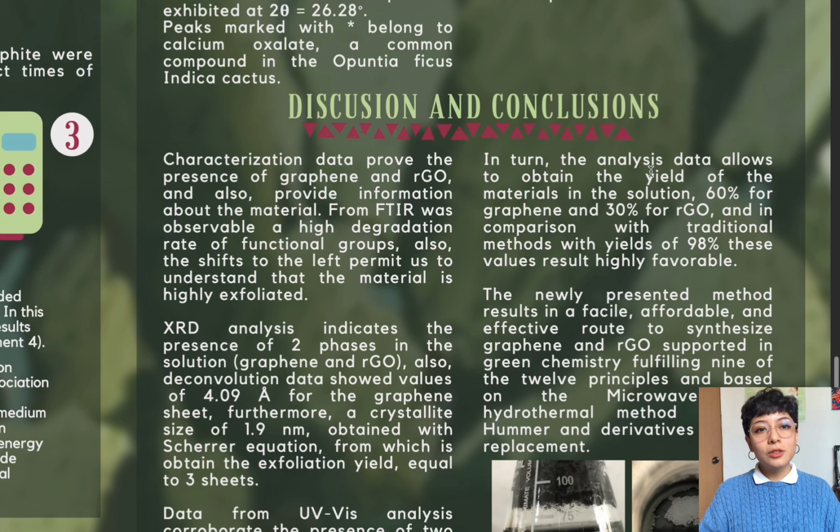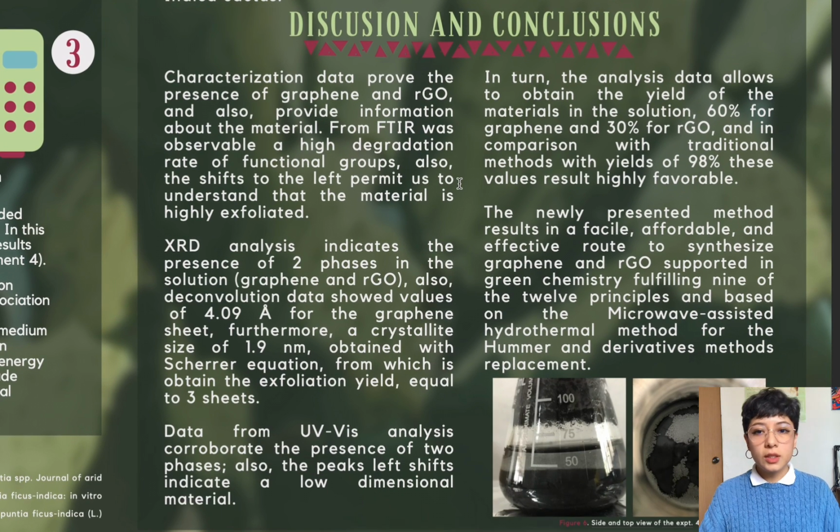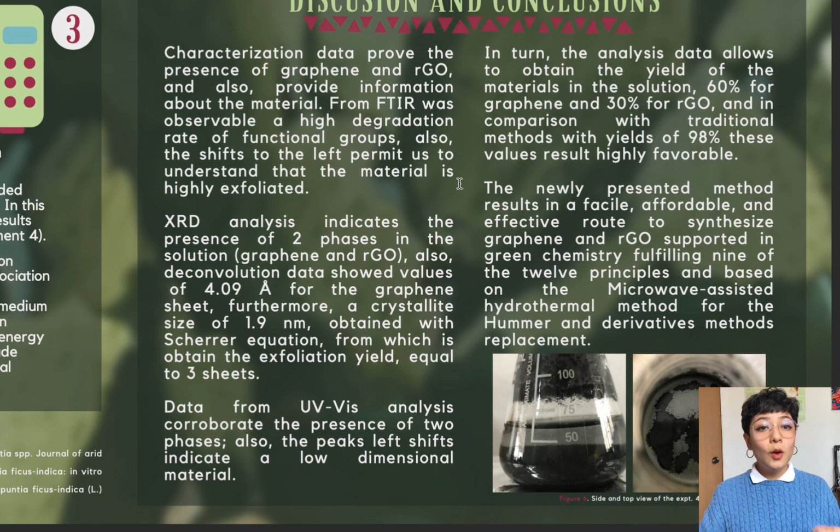Discussion and conclusions. Characterization data prove the presence of graphene and RGO, and also provide valuable information about the material. From FTIR analysis, a high degradation rate of the functional groups was observable, and the shifts to the left let us understand that the material is highly exfoliated.